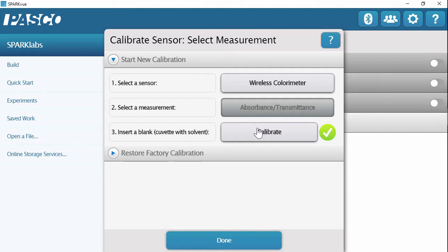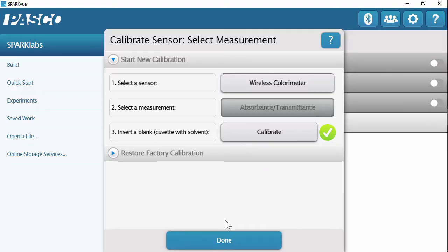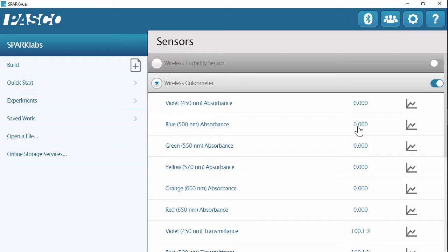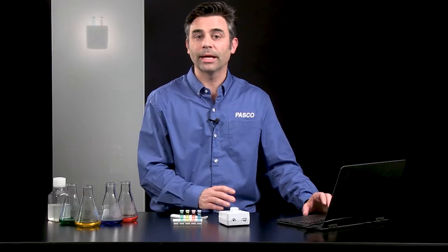And then once it's calibrated, I get this green checkmark. So again, a nice indicator for students and for you to know that something happened and this is calibrated. I'm going to hit done. And since I calibrated the colorimeter, my colorimeter measurements pop up on the home screen. And they're reading zeros for the absorbance and 100% for the transmittance, which is what you would expect for the calibration.